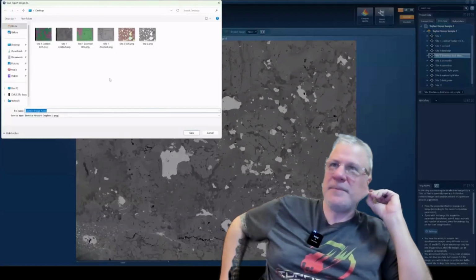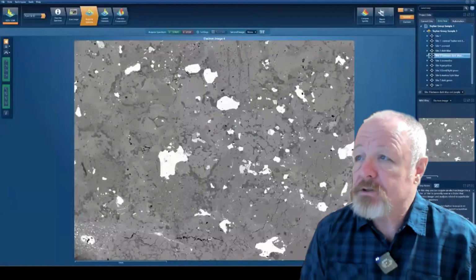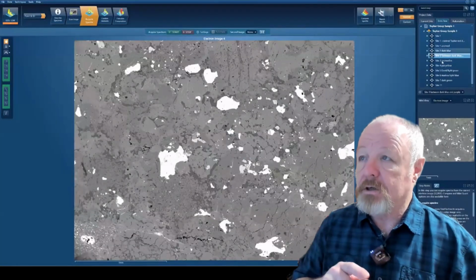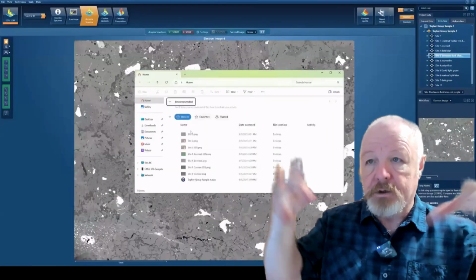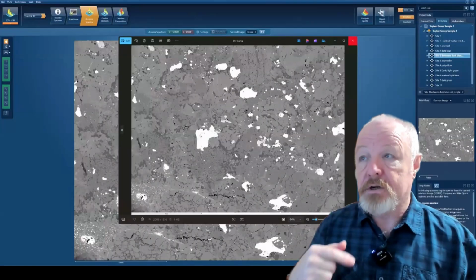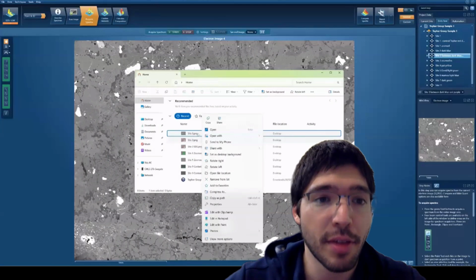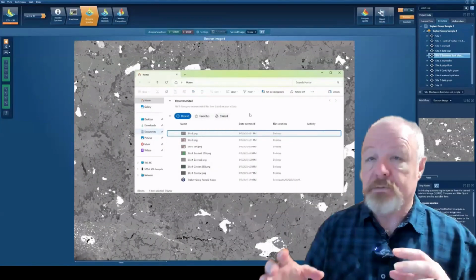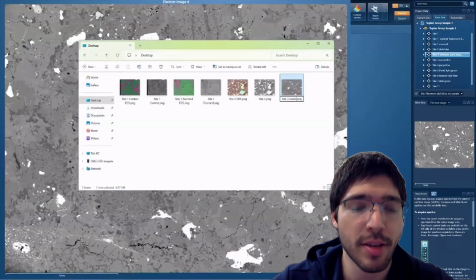Pat, thank you. I just wanted to amplify Daniel's comment. So the EDS, or energy dispersive spectroscopy, is what, by those electrons falling back to their original orbit, allows us to tell what elements are there. Yes, that's a very key thing. It's the mechanism for our element map. We call those characteristic X-rays.